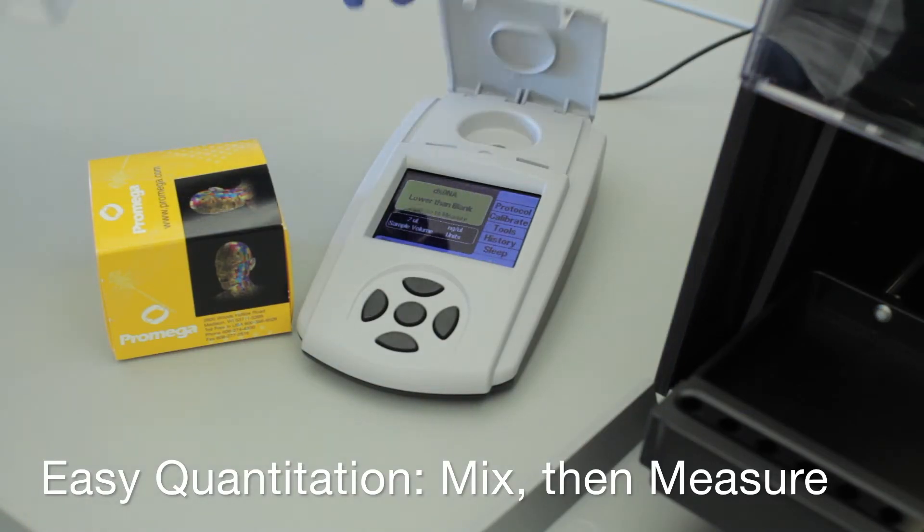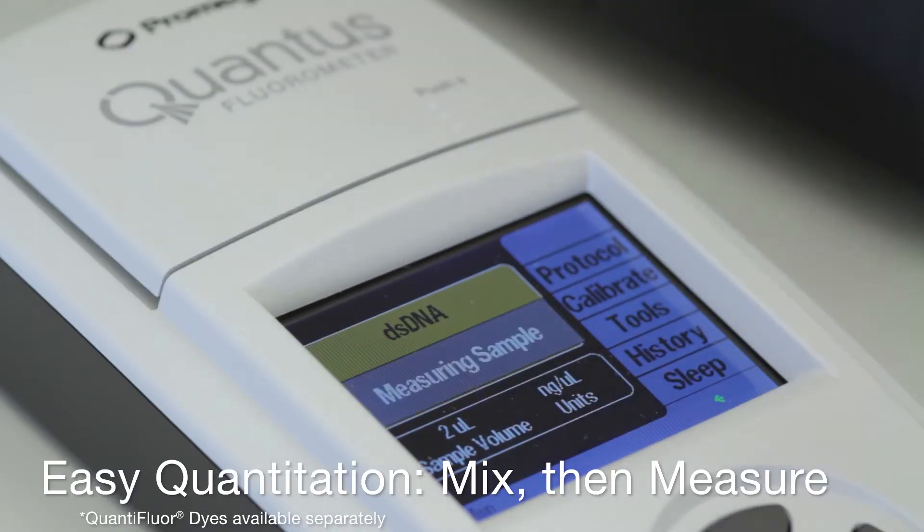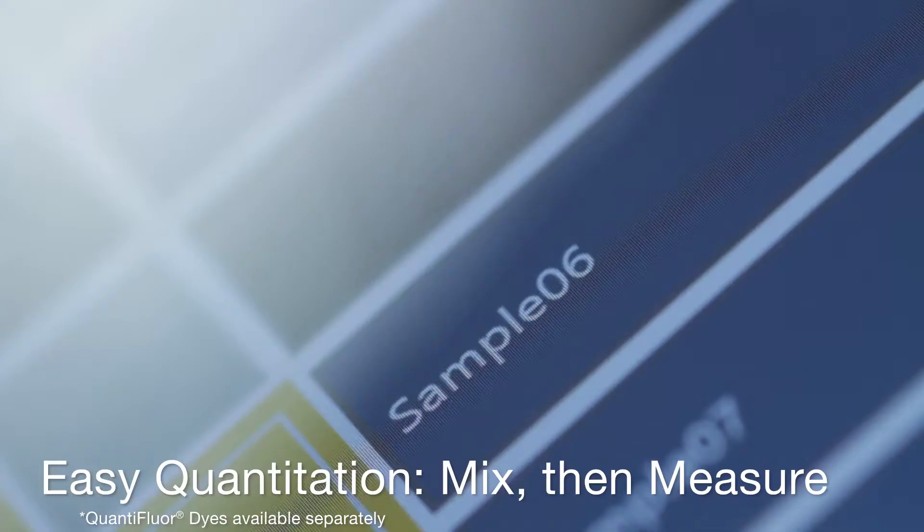Quantitation is easy with the included Quantus fluorometer and the Quantus fluor dyes. Simply mix and measure.